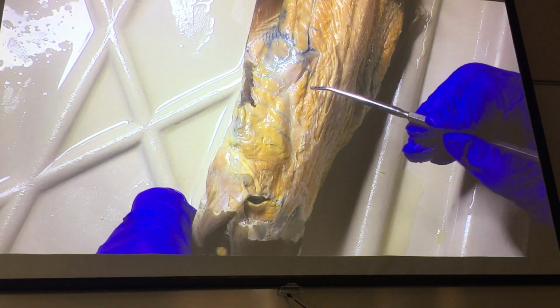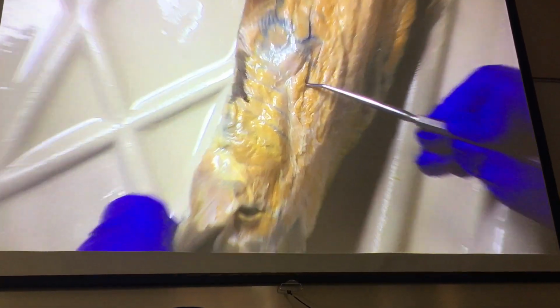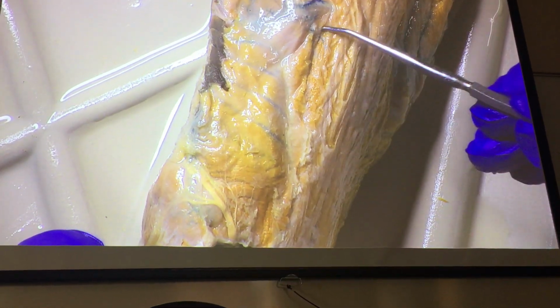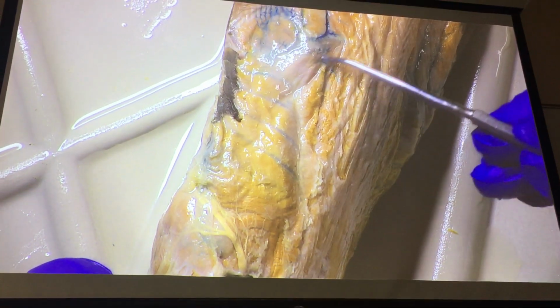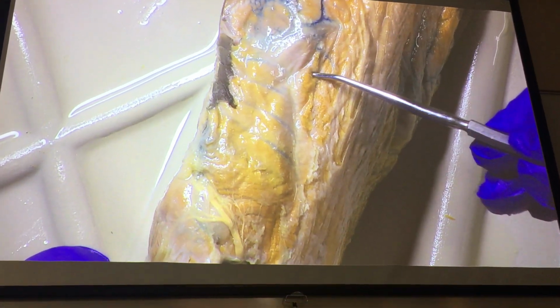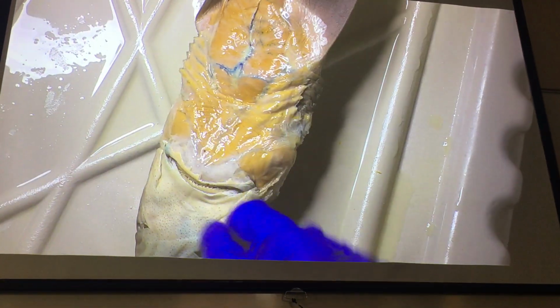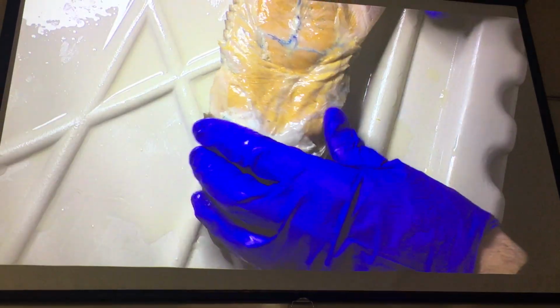There's not a lot to it. So here we can see the scapula, and there's our third through sixth dorsal levators, also called the cucullaris. And again, another one you should know homology for. All right, ventral aspect.